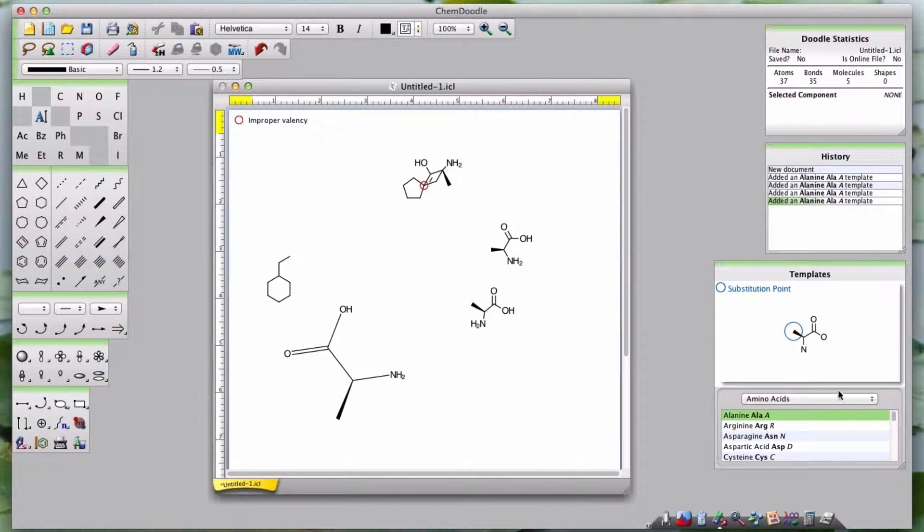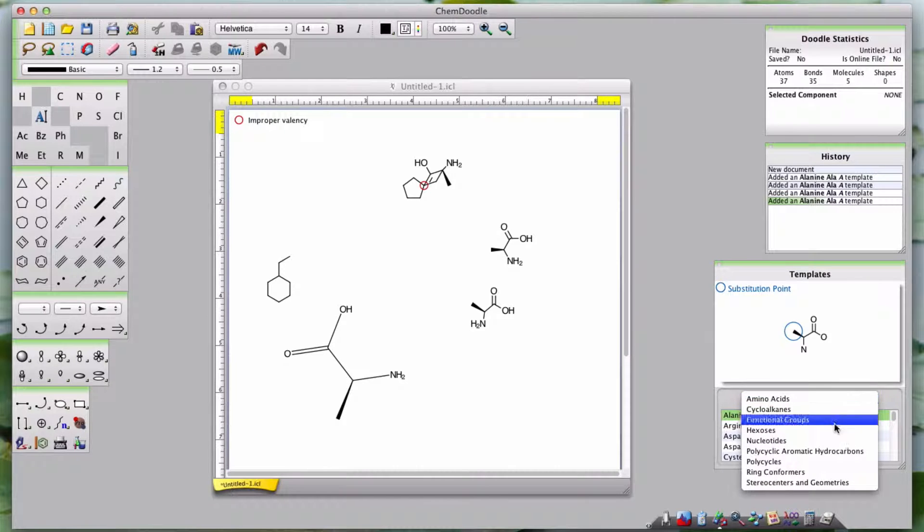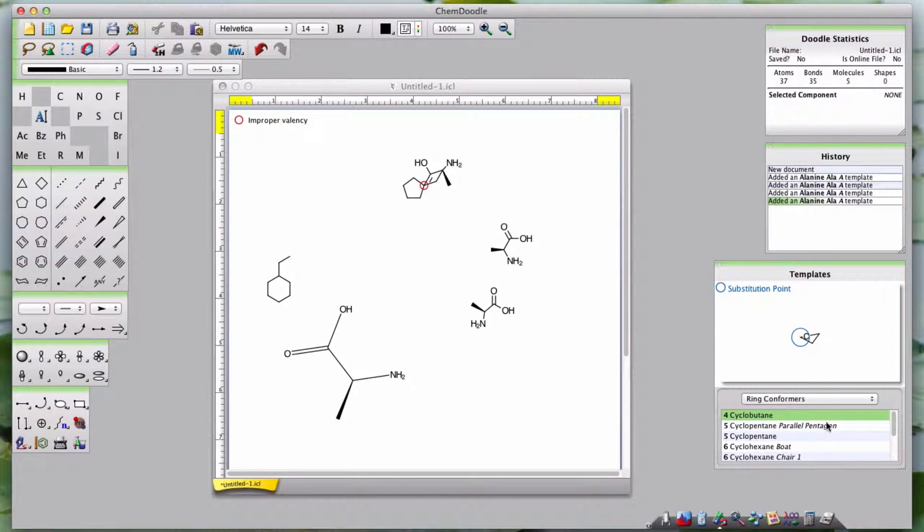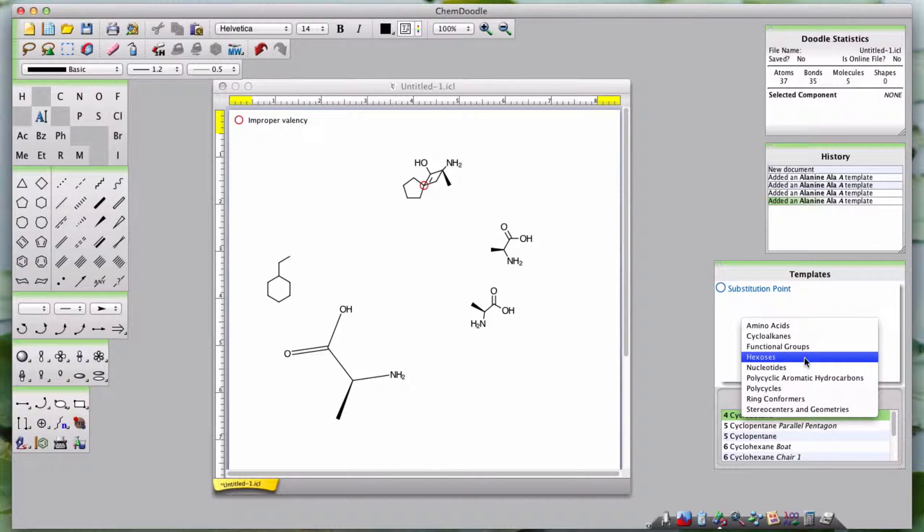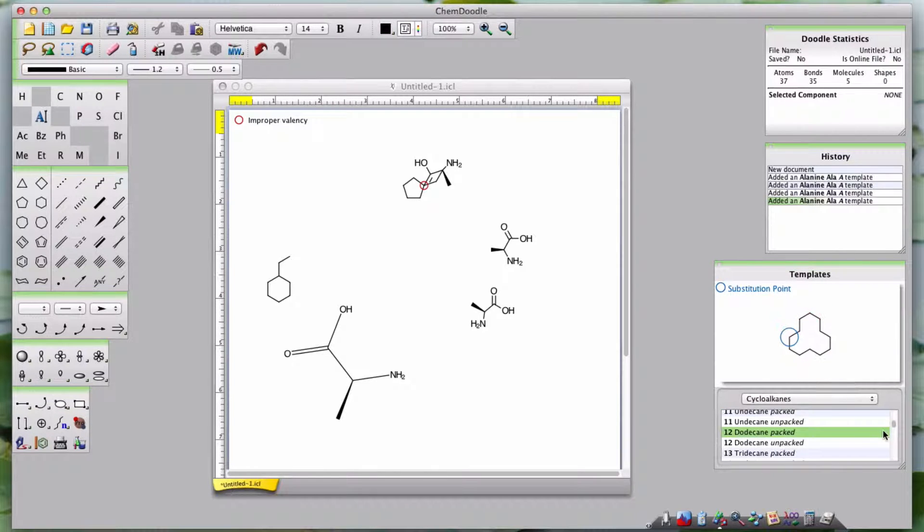Below the Main Structure Panel is a drop-down tool for selecting what template group you want. After selecting the group you want, the list below will be populated with templates from that group.